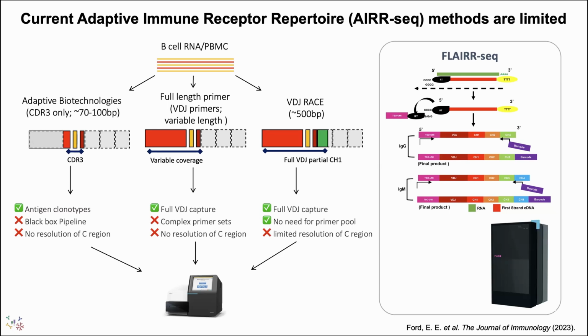But what I think of it as more is a flexible length technology. These transcripts are 1.5 to 2 kb on average, and you can sequence anything from 500 base pairs to 30 kb on the PacBio. What that allowed us to do is not have to worry about whether the length was going to be a restricting factor. We could put the entire transcript on in a targeted fashion and ensure that we got adequate coverage no matter how that length was flexing due to ongoing somatic hypermutation.